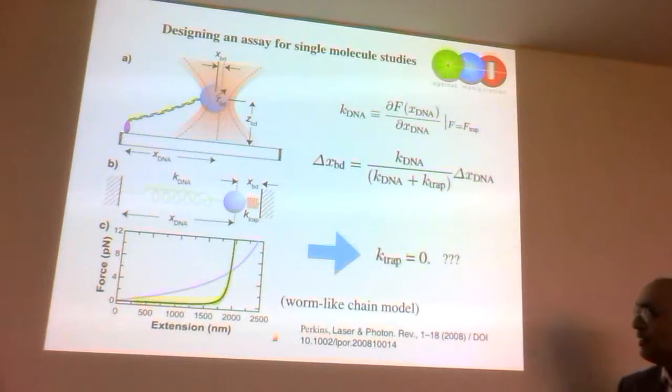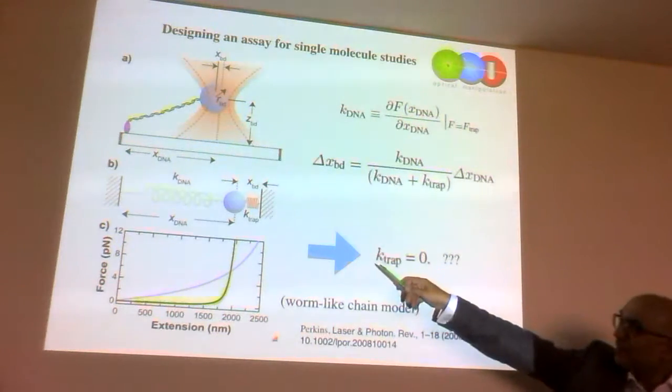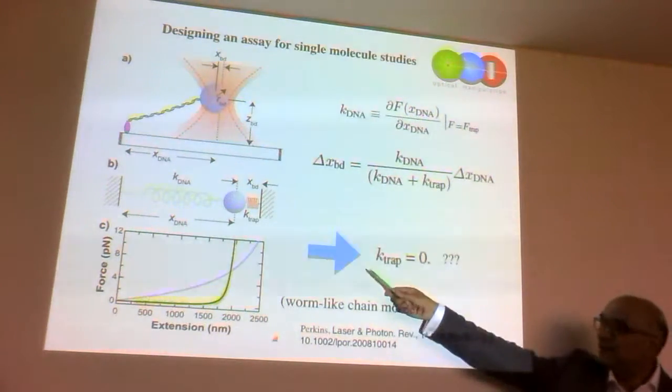Well, you can do other beautiful things. If you want a review paper on this, there is an amazing paper that hardly anybody reads, by Tom Perkins' group in Boulder, Colorado. What I just wanted to say is that the force is, if you like, even though you're measuring it, you've got a trap and you've got a molecule.